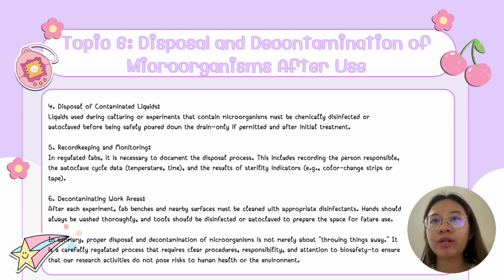Fourth, disposal of contaminated liquids. Liquids used during culturing or experiments that contain microorganisms must be chemically disinfected or autoclaved before being safely poured down the drain, only if permitted and after initial treatment.